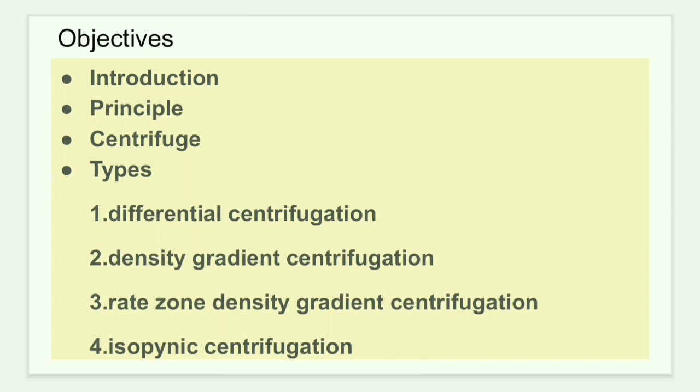In this video, we will discuss centrifugation. The objectives are introduction to centrifugation, its principle, centrifuge, and types, that is differential centrifugation, density gradient centrifugation, rate-zonal density gradient centrifugation, and isopycnic centrifugation.